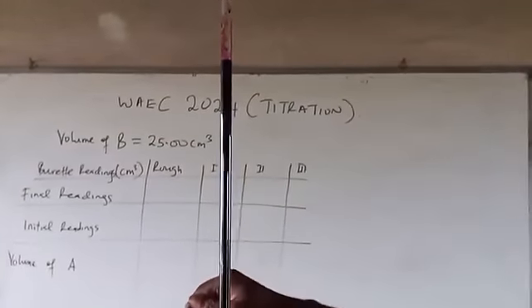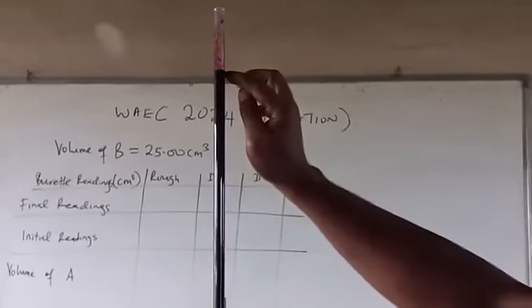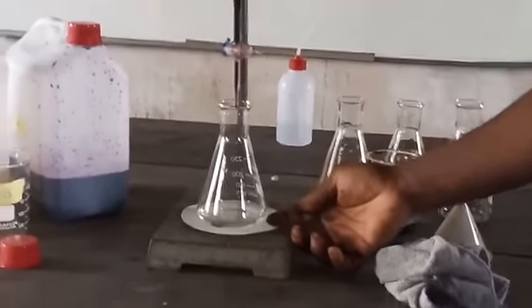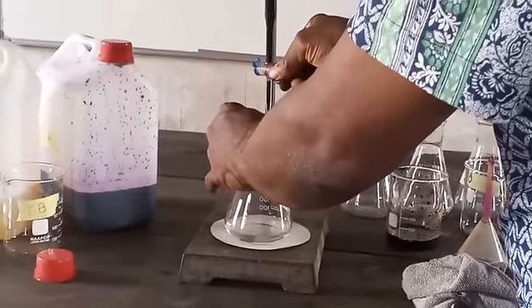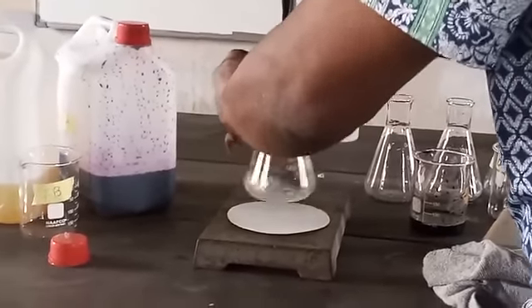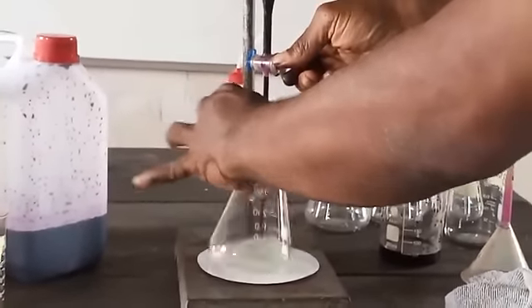We're about to start the titration now. We'll have solution A, potassium permanganate, in the burette leveled up to 0. Then we'll have solution B with the H2SO4 inside it in the conical flask. So we start titrating to know when the color will change. As you add the chemical, you shake the flask, going drop by drop.